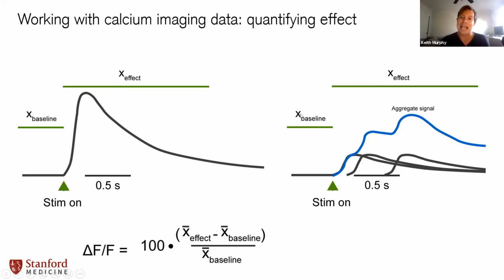And Kim already mentioned this: why use GCaMP slow? It's because you can get an aggregate. A single neuron might have a profile that looks like this nice smooth curve, but if you start adding the fluorescence together, you get a noisier, bumpier, but ultimately larger aggregate signal. Just to let you know, this is what your signal is really doing. It's integrating, or adding together, all of the individual cells in the field of view that are outputting signal.